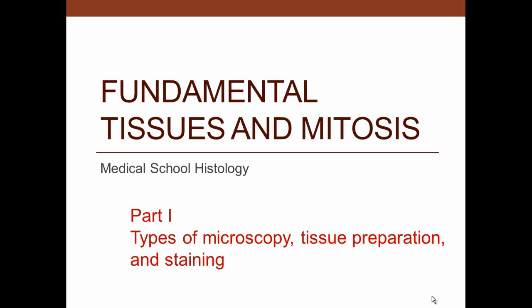This is medical school histology. Part 1 will talk about the types of microscopy, tissue preparation, and staining.